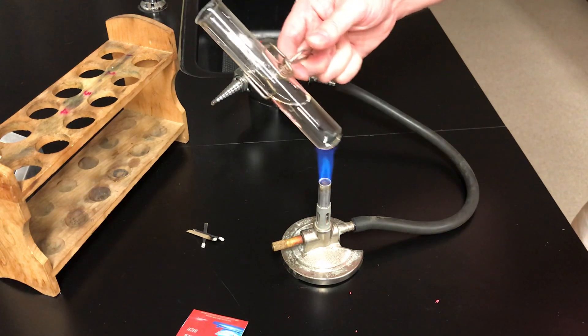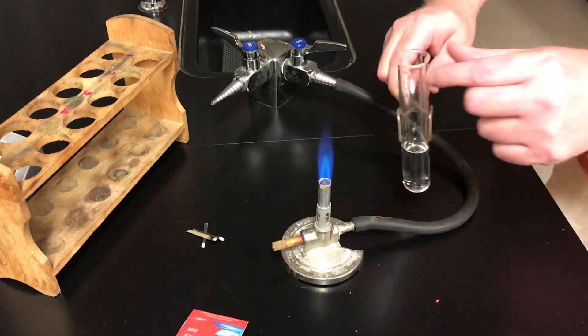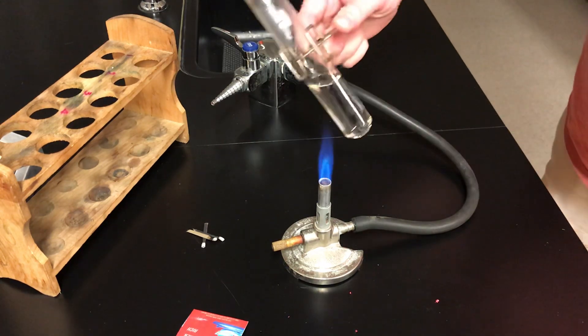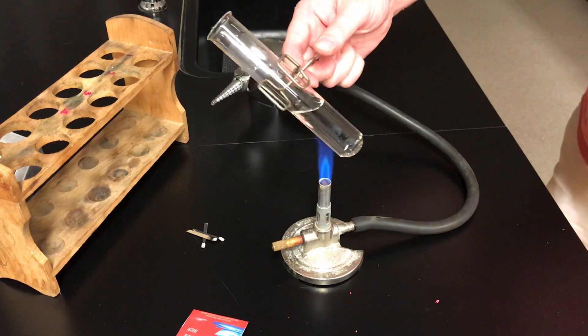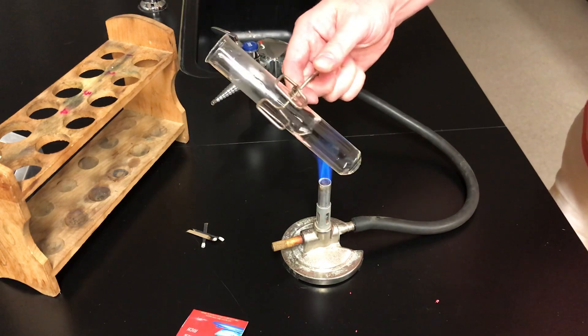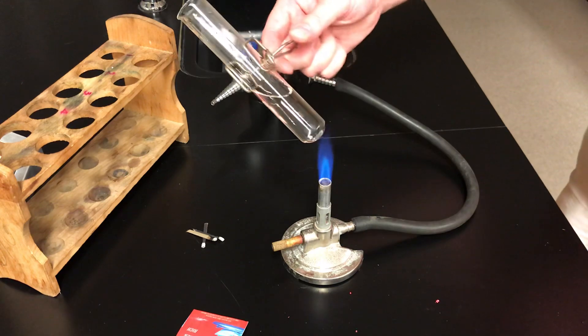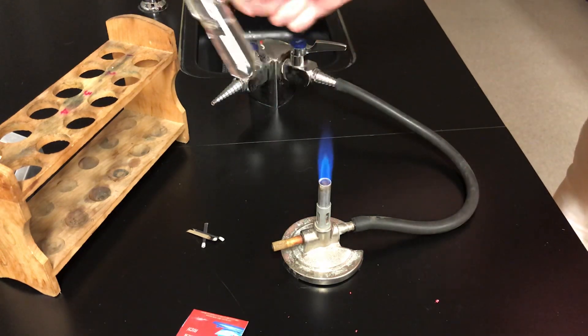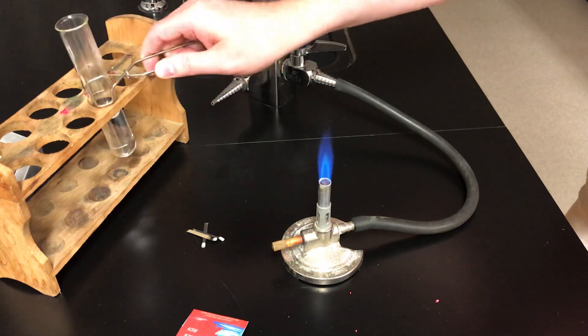So the test tube tongs do not get hot. The test tube itself, even way up here at the top, will not be hot. But at the bottom where you had it in the flame, that part of the test tube is going to be quite hot. So you wouldn't want to touch that. So there we have it. Lighting a Bunsen burner, using it to heat a test tube. Let me just put that in a test tube rack here.